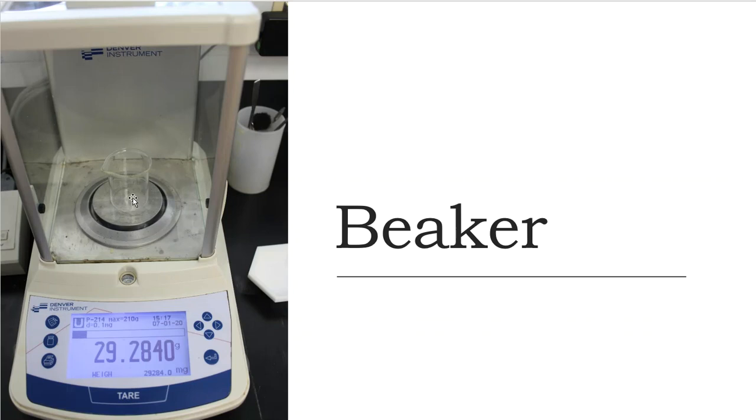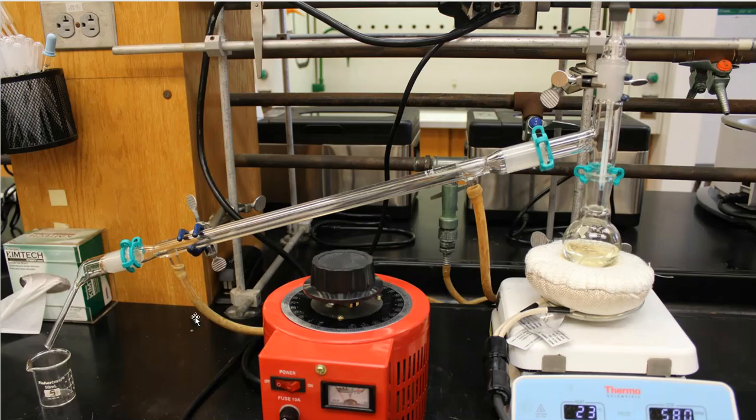So if this can drip, drip, drip into that beaker and I can get a mass before and a mass after, I'll be able to calculate how much I've actually made. All right, so I needed to simple distill this over. So here is what a simple distillation apparatus looks like.